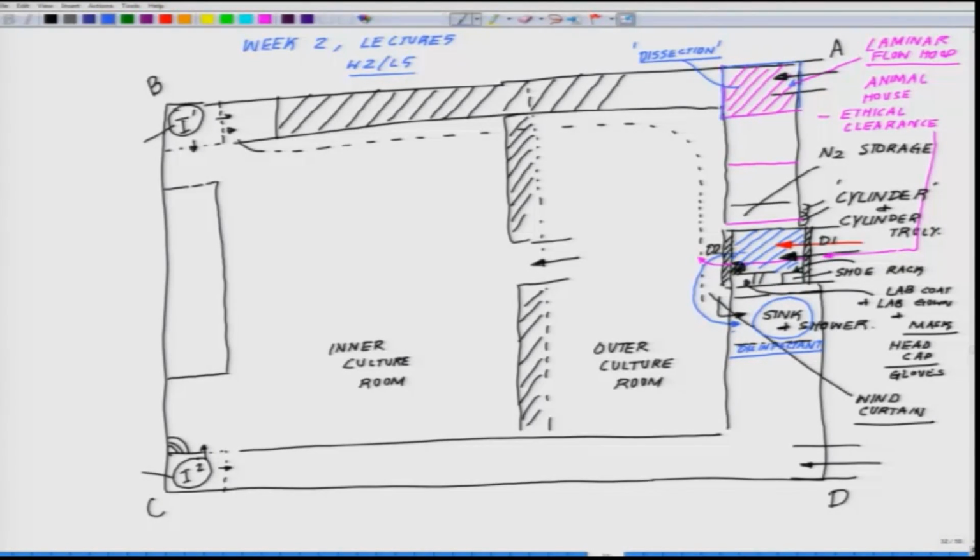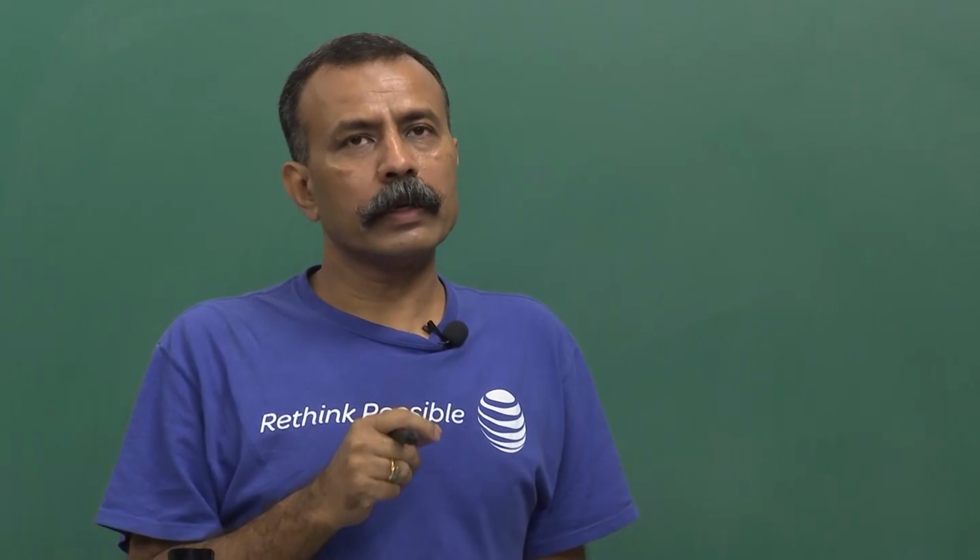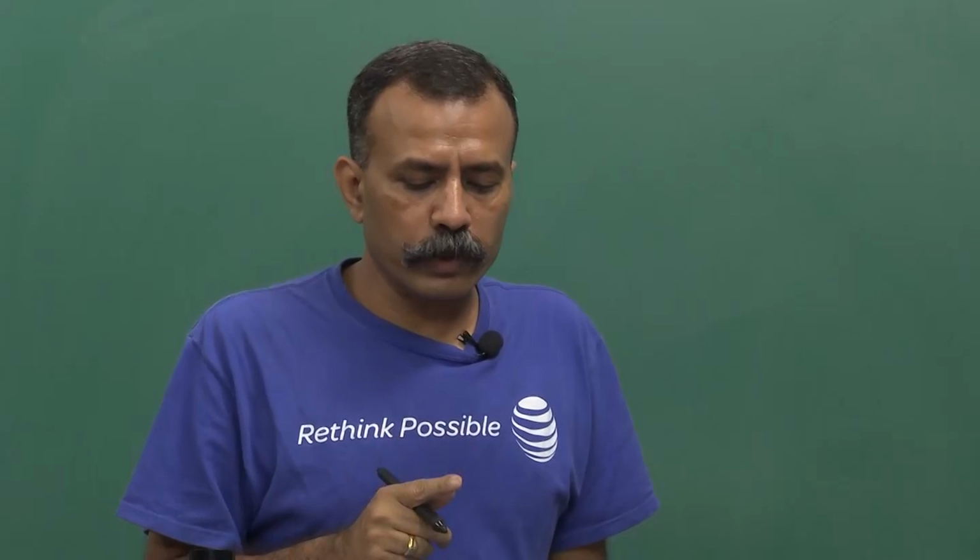hood with a sitting arrangement like this, or like this, or maybe like this, we cut the. So, before laminar flow hood design, let us decide one more stuff.